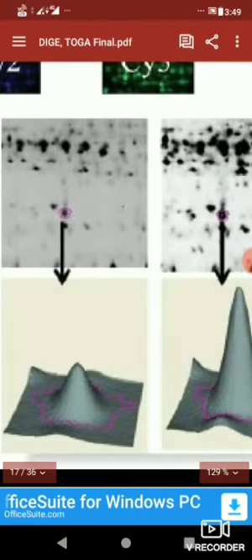So you can see here, this is the same spot. This one is also the same spot. But then just see the variation. Here the protein is present. Here also the protein is present. You can see the concentration, the peak formed by each of those proteins. Yeah, they are totally different.